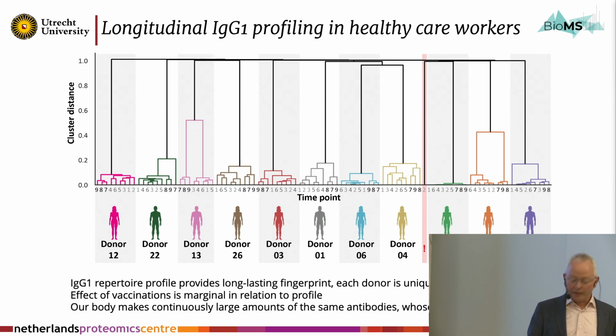We see no overlap at all. Now what is nice here, we see one person that was a mismatch. It should have been donor 19, but I don't know, a nurse or a PhD student screwed up. We didn't know this, but we directly see this cannot be true. This is an antibody repertoire that doesn't make any match with any of the other antibody repertoires. A sample got mixed up. Some, you see no difference at all, while some you see a bigger difference.